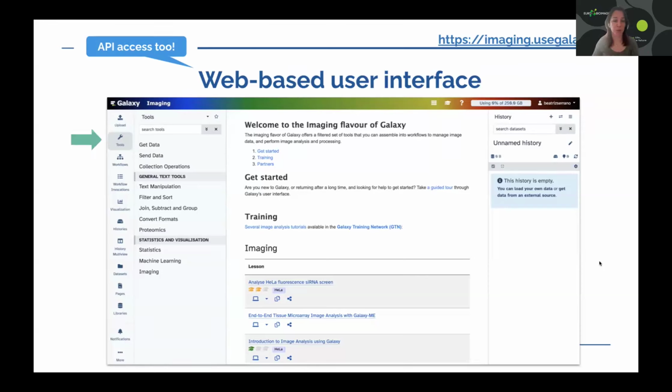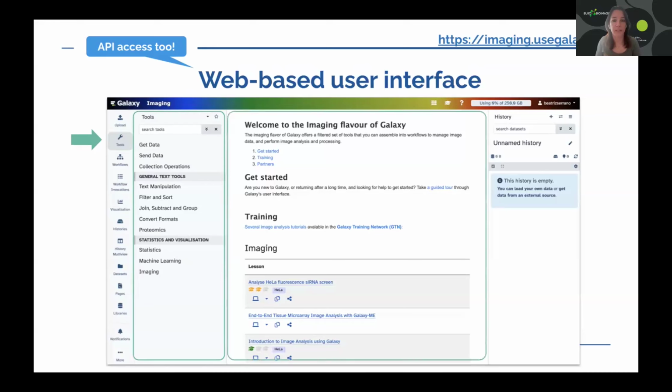And I am going to show a bit how the interface looks. You see on the left side there's a button called Tools, and this is the one that is pressed at the moment. That means that on the left panel you find the different tools by categories. Each one of these titles that you see in there has plenty of tools inside. Then there is a central panel in which one can see the different operations that are going on. If you need to input parameters to a tool, all these different activities will appear in the central panel. So this is a very changing part of the interface.